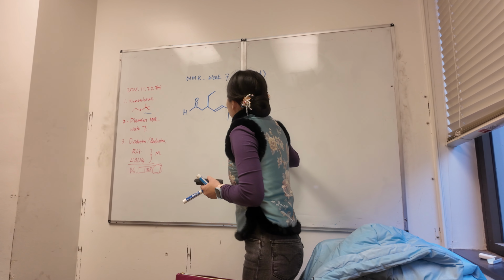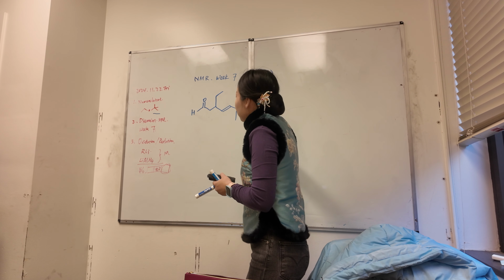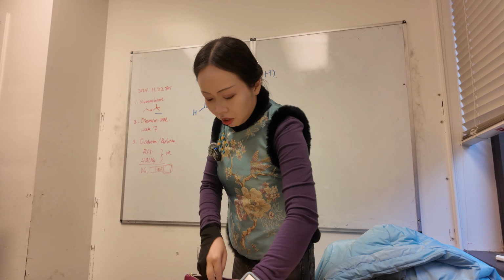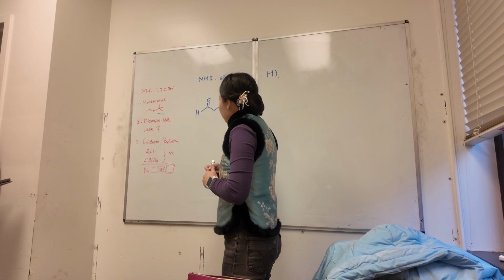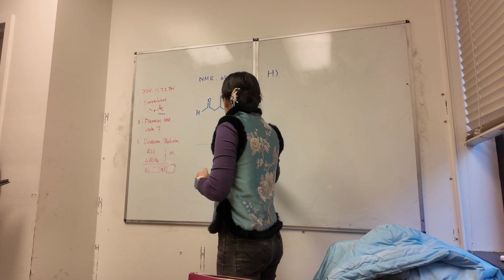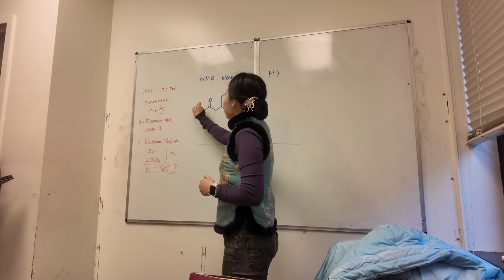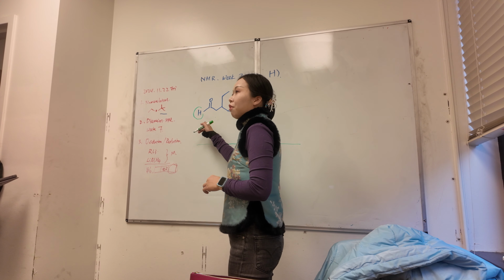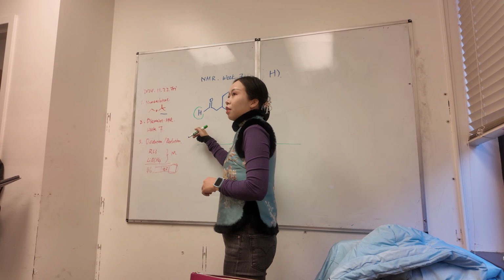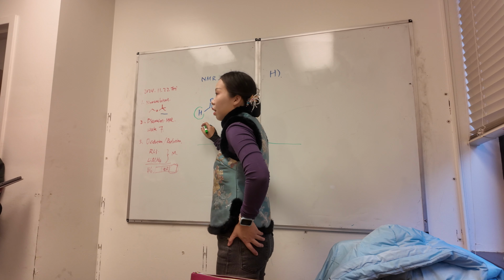Right, we'll do integration, which is basically asking for the peaks and what the peaks are. Okay, what are the peaks? Let me just get you ready for your week 8 anyway. You will get there. Okay, where is this hydrogen supposed to be? Did you learn this already or not? Where is this hydrogen roughly, in ppm? Did you learn this or not? Haven't. Okay.